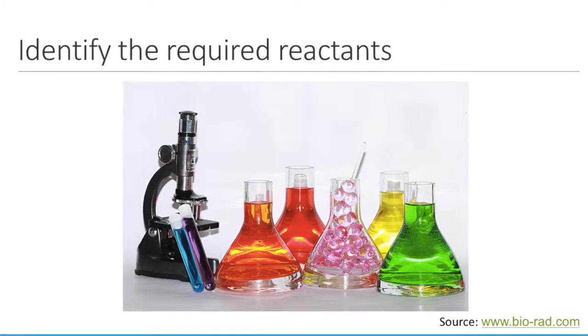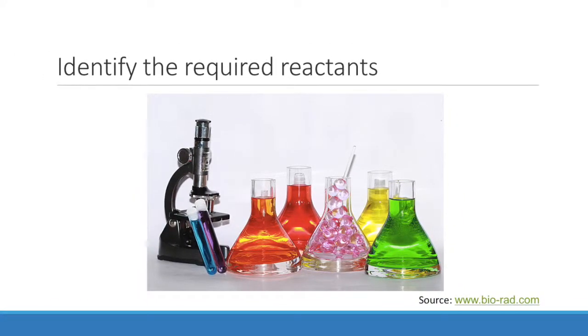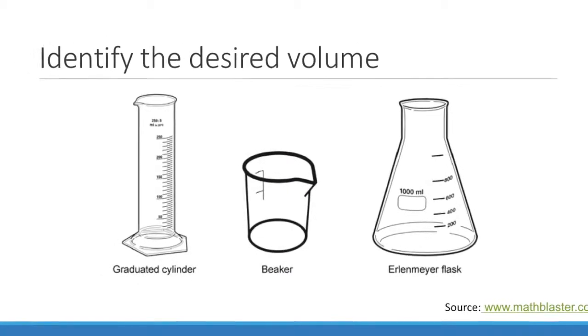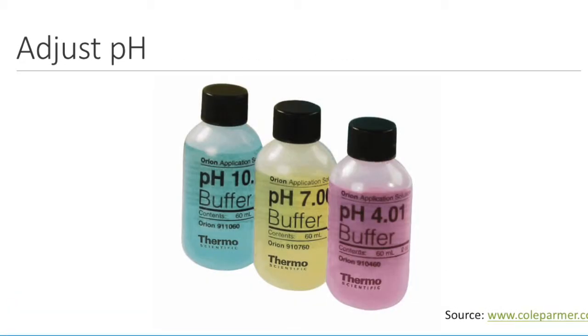In this video, we will explain some methodologies of preparing solutions and also some advice that should be taken into account in order to verify that a solution has been well prepared, such as the following. Before preparing any solution, it is important to know the reactives that you are going to work with. Know the desired volume. It is important to know the protocols of each solution, the solution quantity for each reaction, and the volume unit.